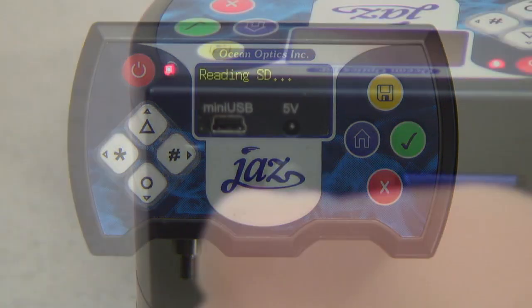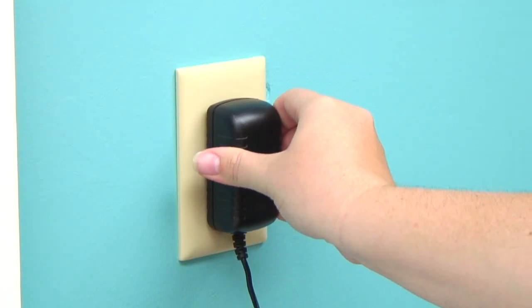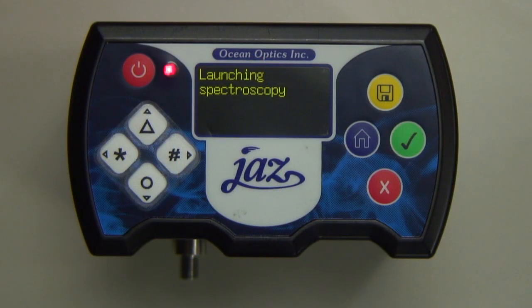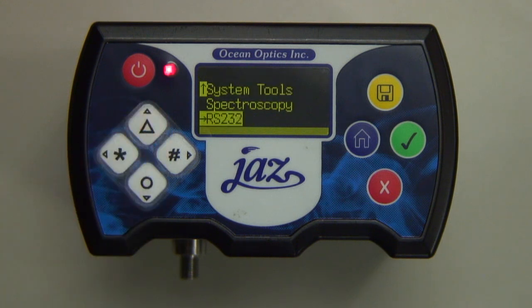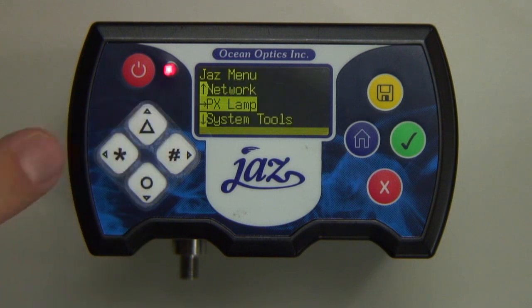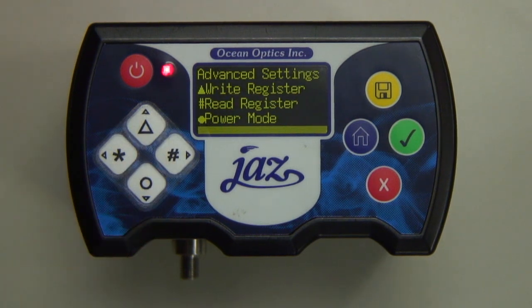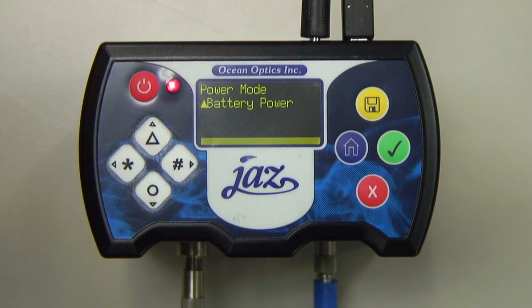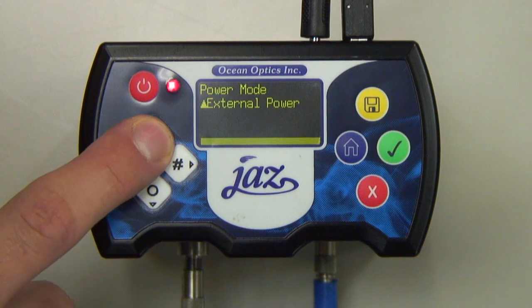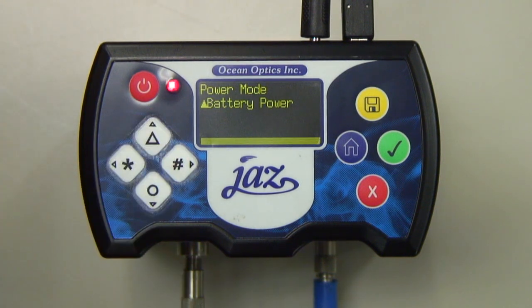These are external power and battery power. When running the PX for extended periods, we recommend connecting the Jazz to a wall outlet and operating in external power mode. Once your Jazz Spectrometer is powered on, you can find these options by navigating from the main Jazz menu. Choose the PX Lamp menu item and enter Setup. Select Advanced Settings and finally Power Mode. We're currently running in Battery Power Mode. Pressing the triangle button on the Jazz DPU will toggle the setting between External and Battery Power Mode. We will remain in External Power Mode for the remainder of this video.